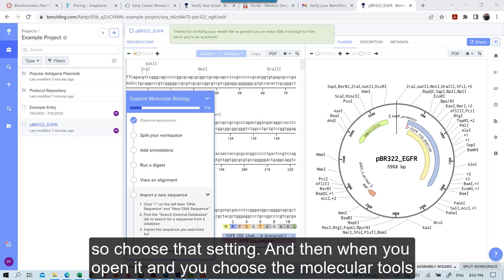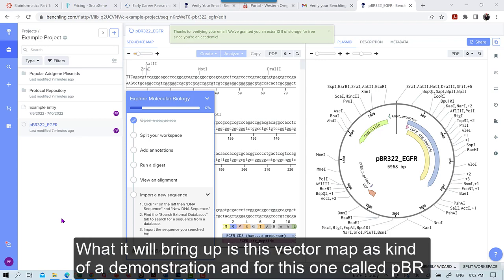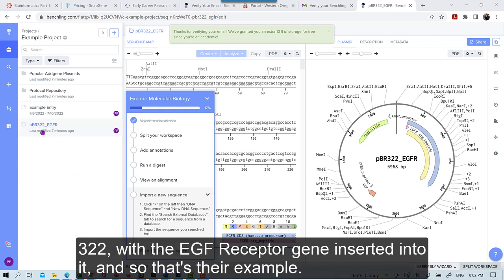And then when you open it and you choose the molecular tools, what it will bring up is this vector map as kind of a demonstration. And so this one is called PBR322 with the EGF receptor gene inserted into it. And so that's their example.